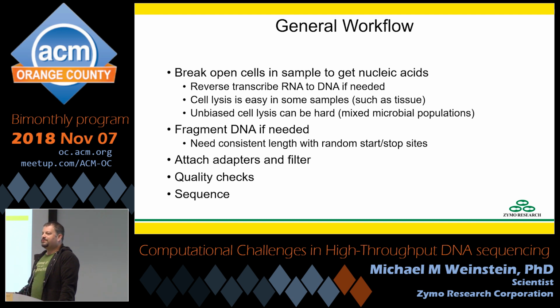So the adapters will handle things like getting the DNA to stick down to your flow cell, which is the actual disposable piece that goes into the sequencer. It'll handle things like giving it priming sites for that DNA replication process I just showed you. It may even barcode it so that you can tell the origin of the sample and things like that. That is literally an adapter between the DNA from your sample and your hardware.